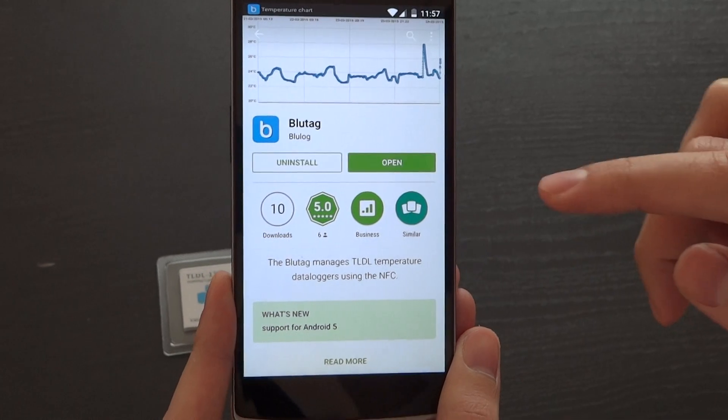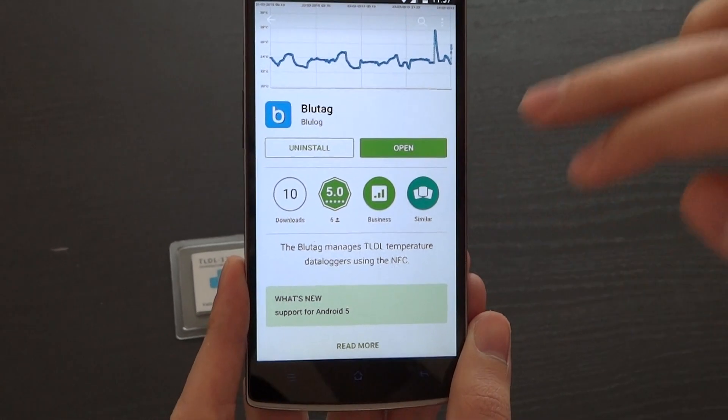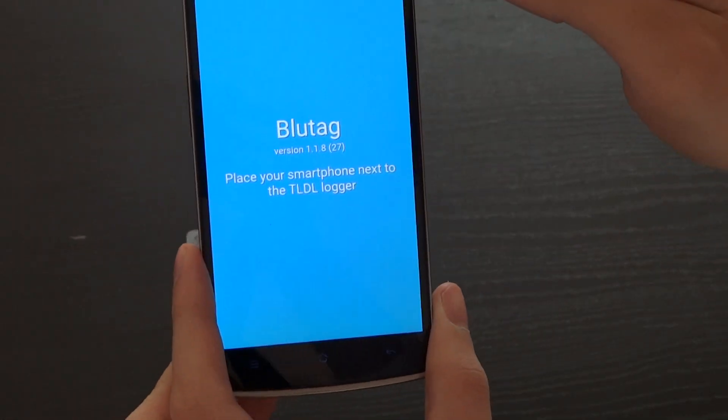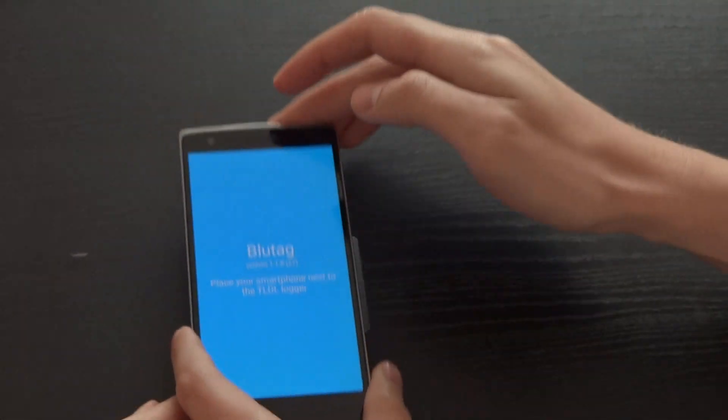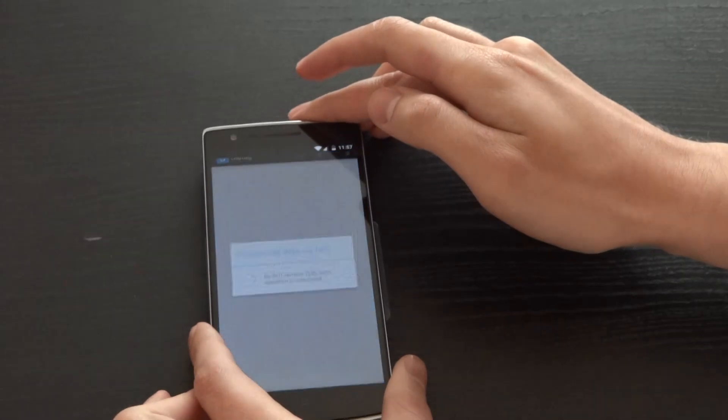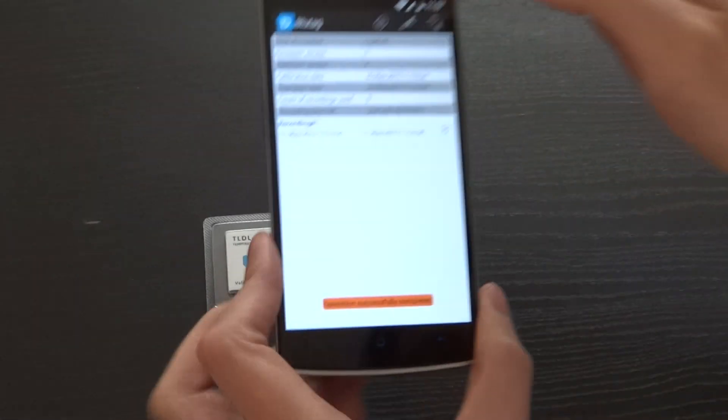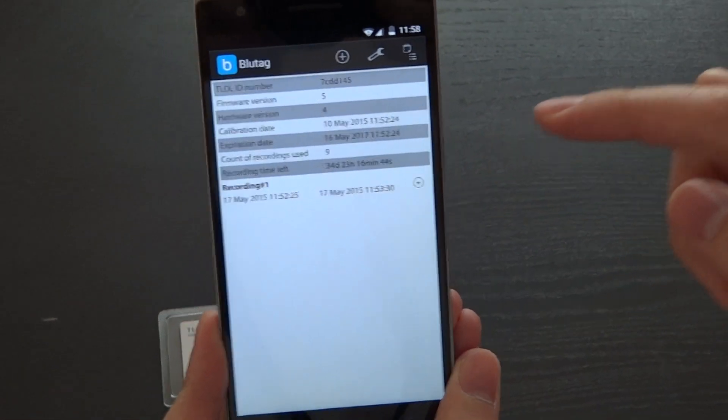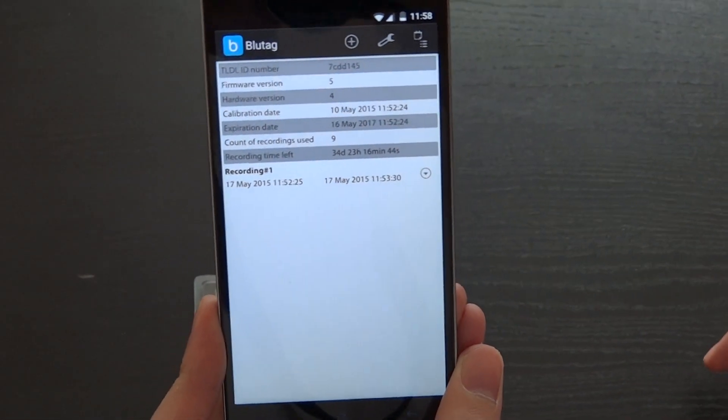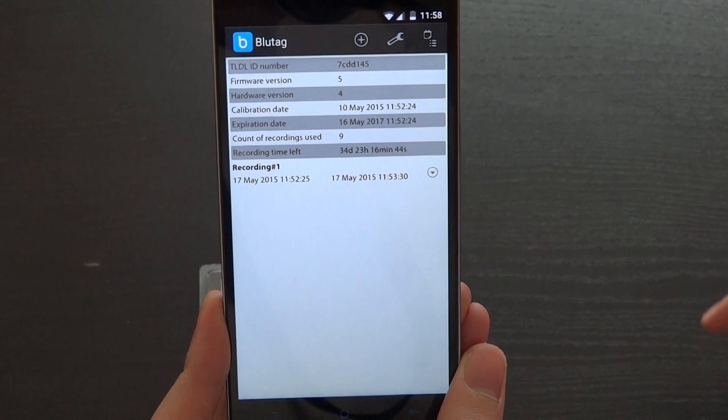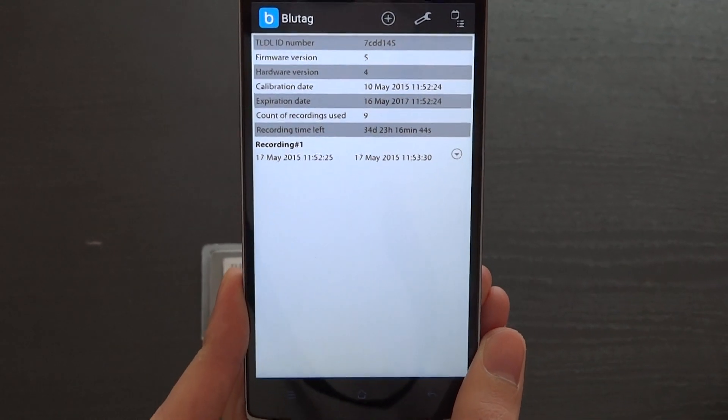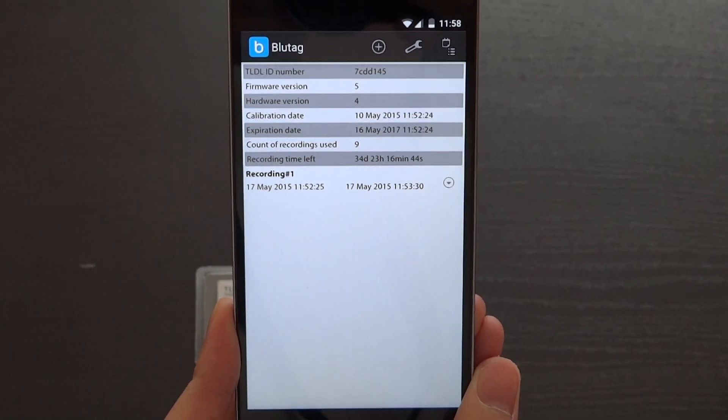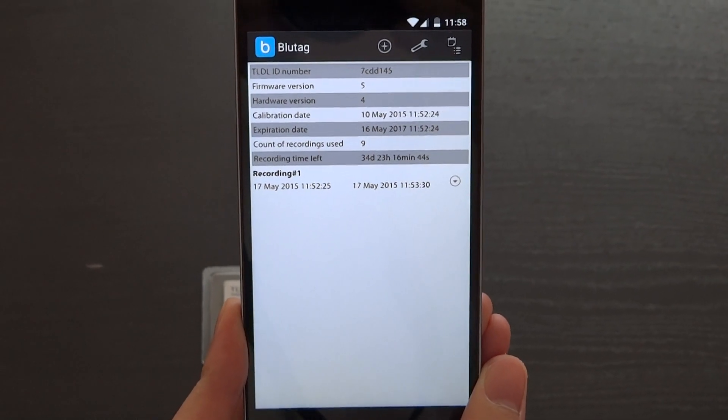Once the app is installed, open it and place again your smartphone next to the logger. You will be redirected to the main page of the logger containing information such as ID number, calibration date, and expiration date.